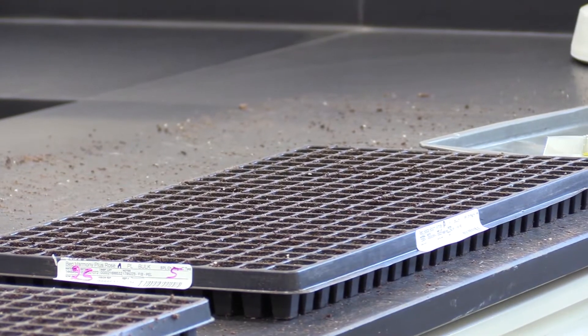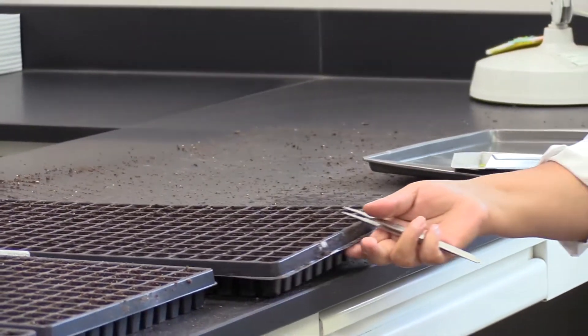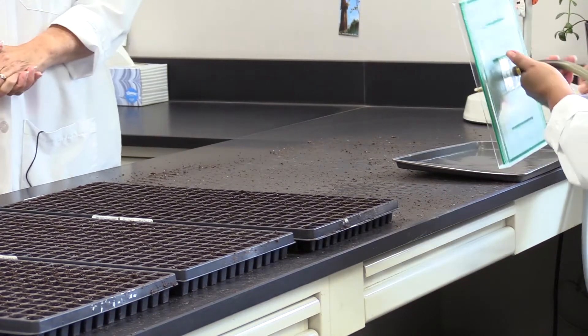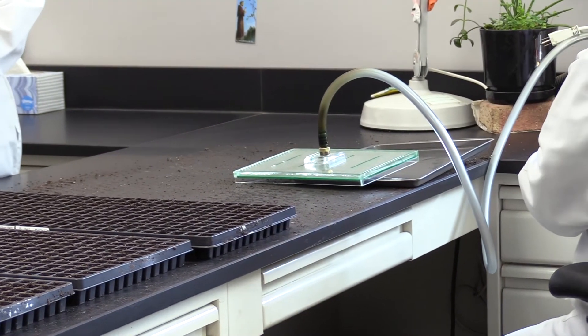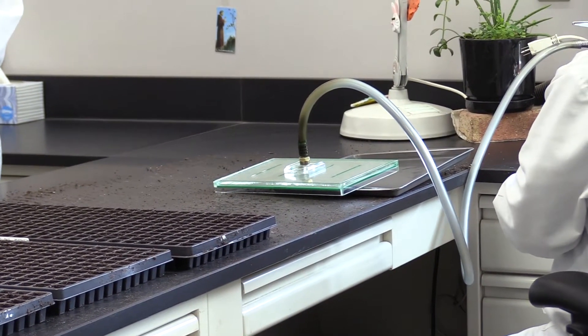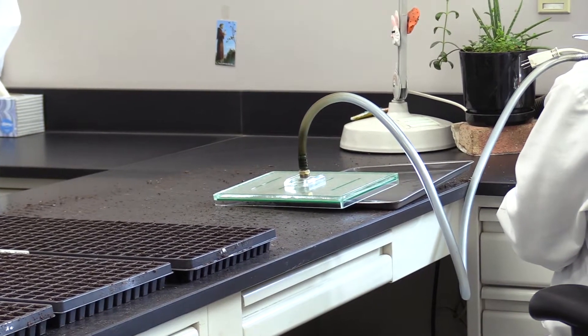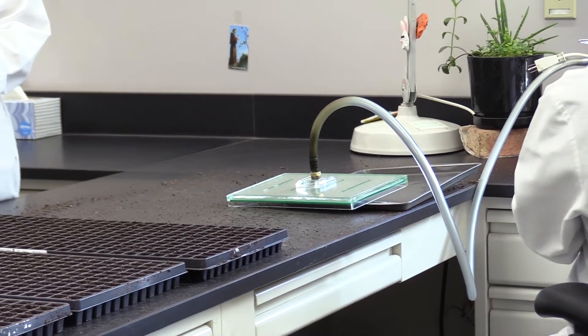She's got a vacuum line, so she can turn the vacuum on and off. When the vacuum is on, the seeds stick to the plate, and when she hits the foot pedal it'll discontinue and the seeds will fall down into the flat. There's exactly one seed per cell, which is very important from a testing standpoint. It's a very neat contraption — saves a lot of time.